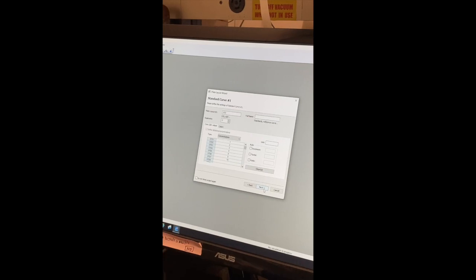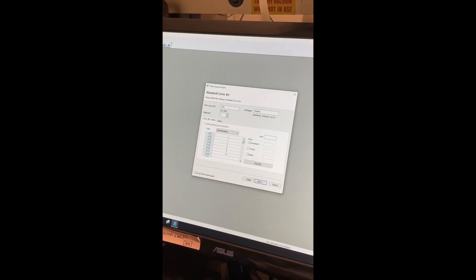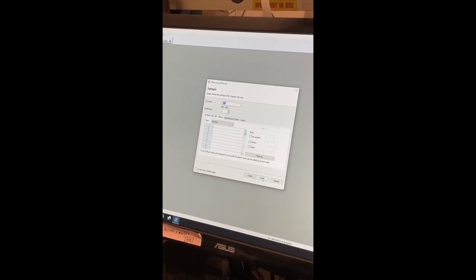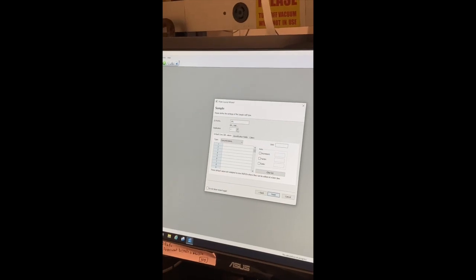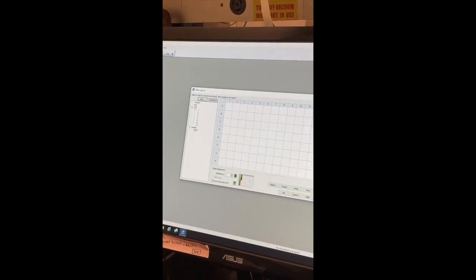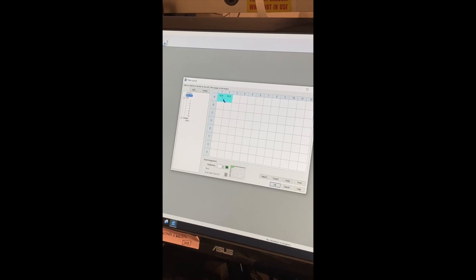And then you want to click next. And you can click up here and write down standard curve. And you click next. And then you have your samples. You want them to be in concentrations. And you want those in replicates of 2. And click finish. And then this should have everything set up. You want to have a blank right here.